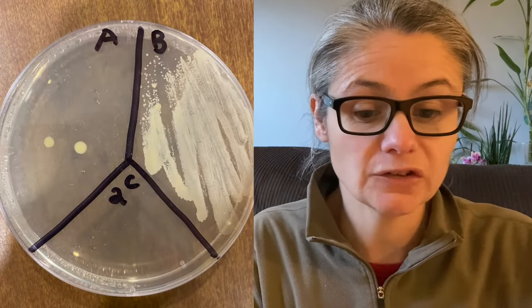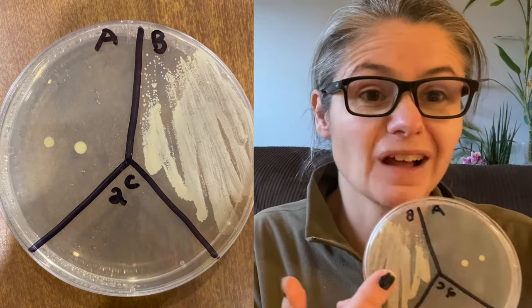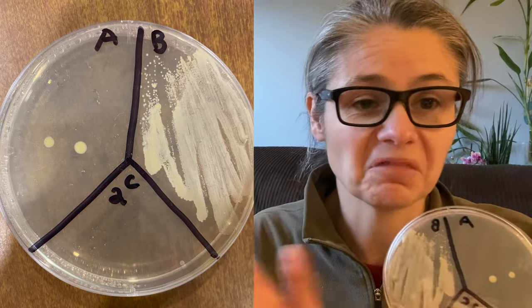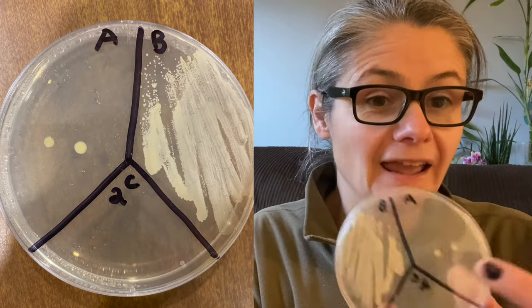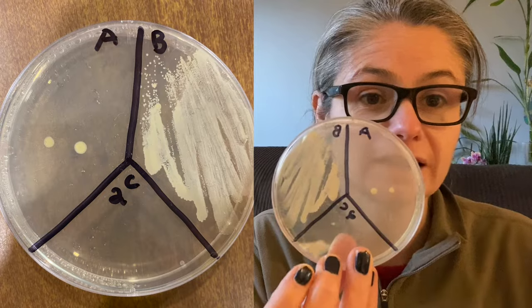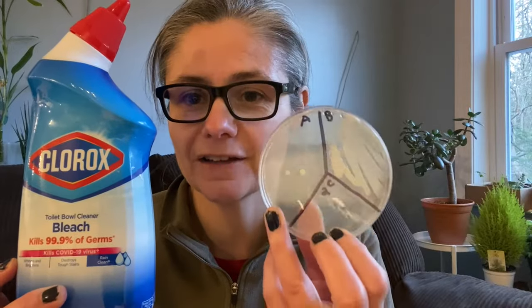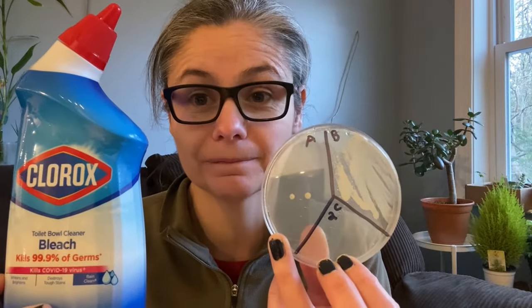Let's get some results. Looking at the Petri dish, you can see in the area B for before, lots of bacteria. Too many to count, lots of bacteria there. And then A after, I only count two colonies. That's it, just two. I think the Clorox toilet bowl cleaner with bleach does a fantastic job at disinfecting the toilet.